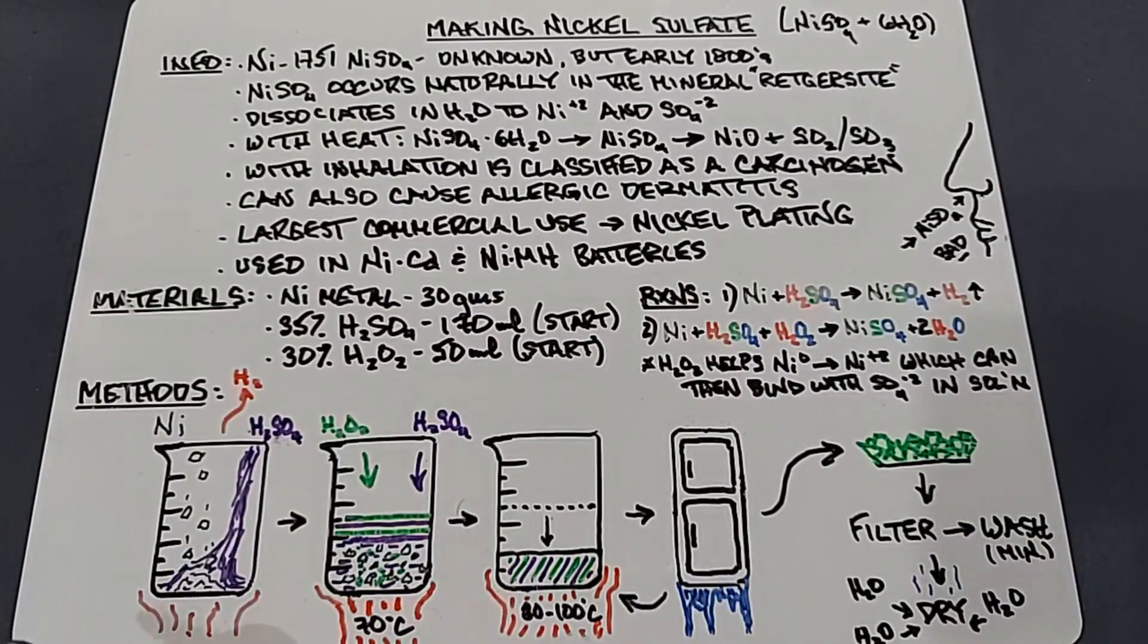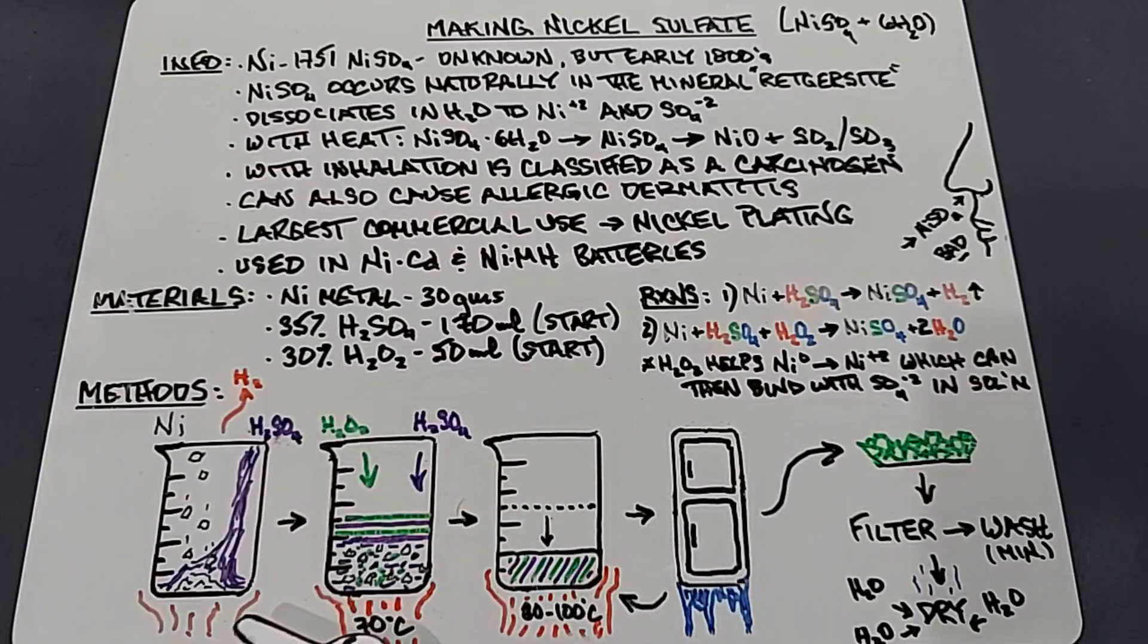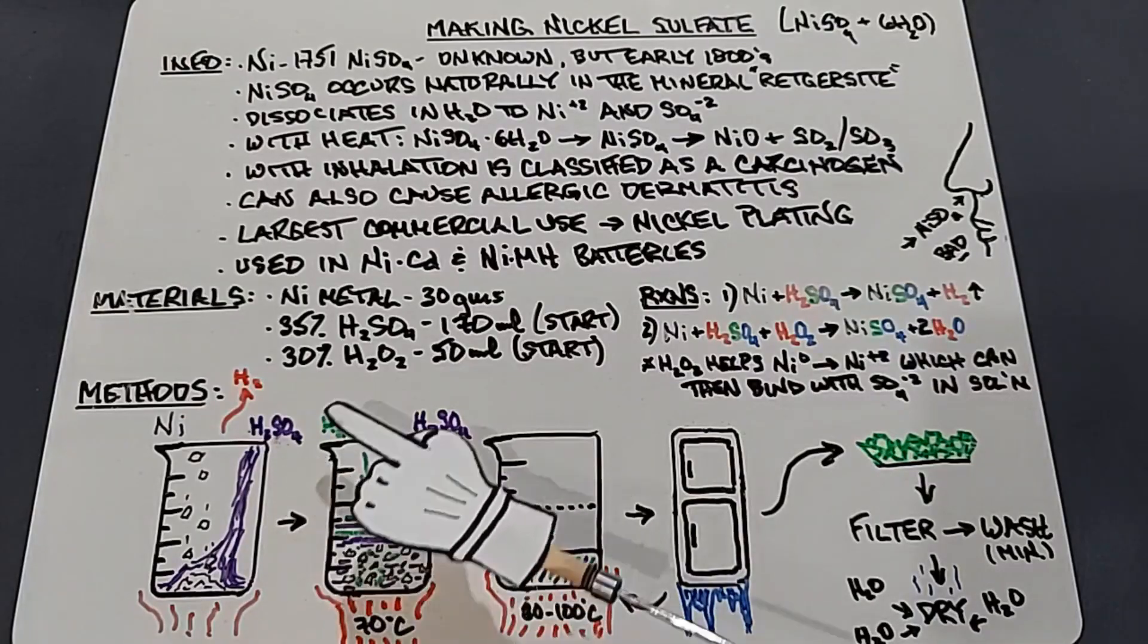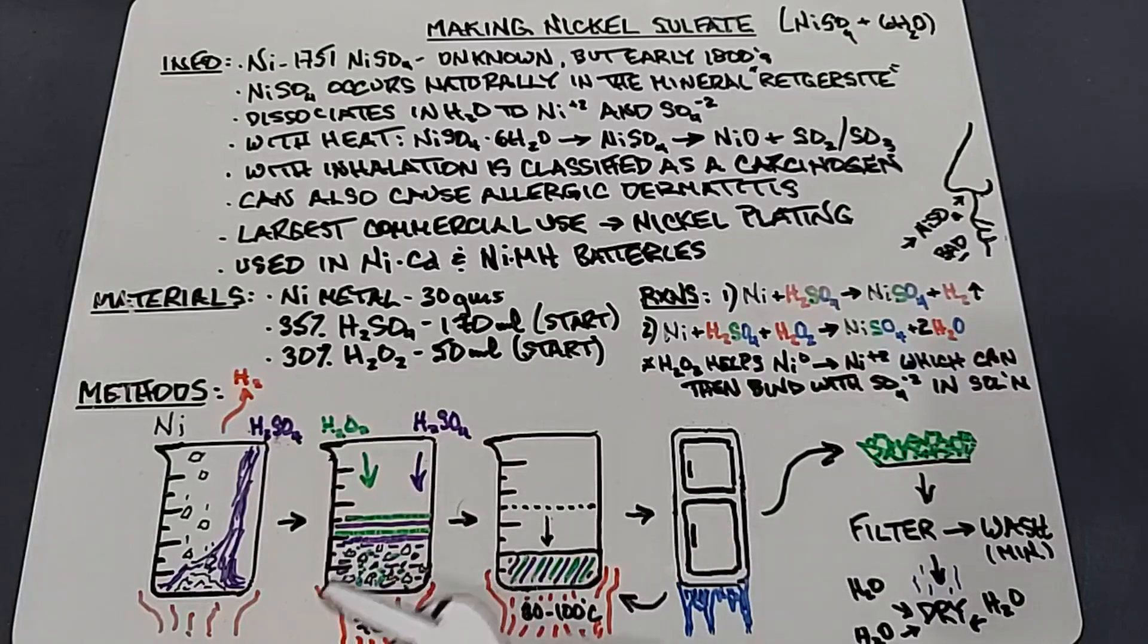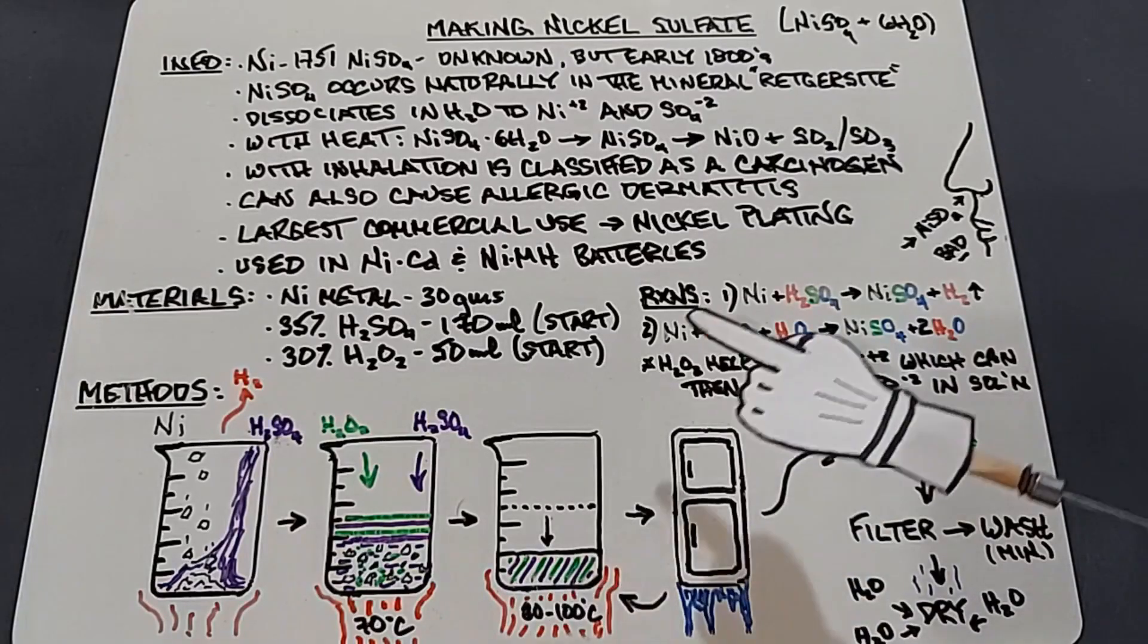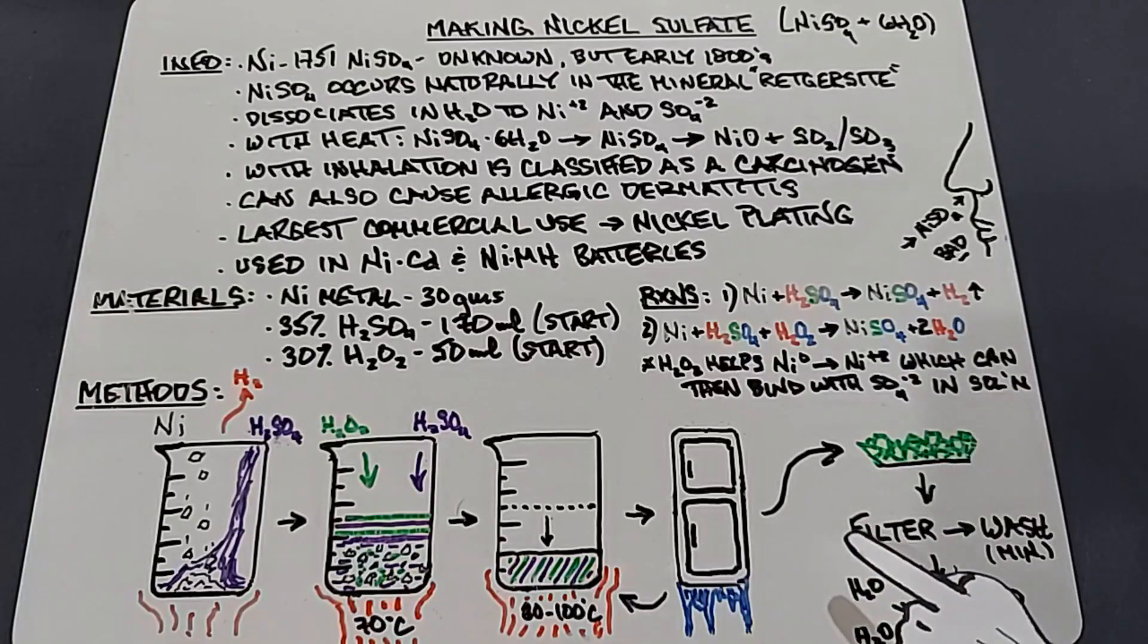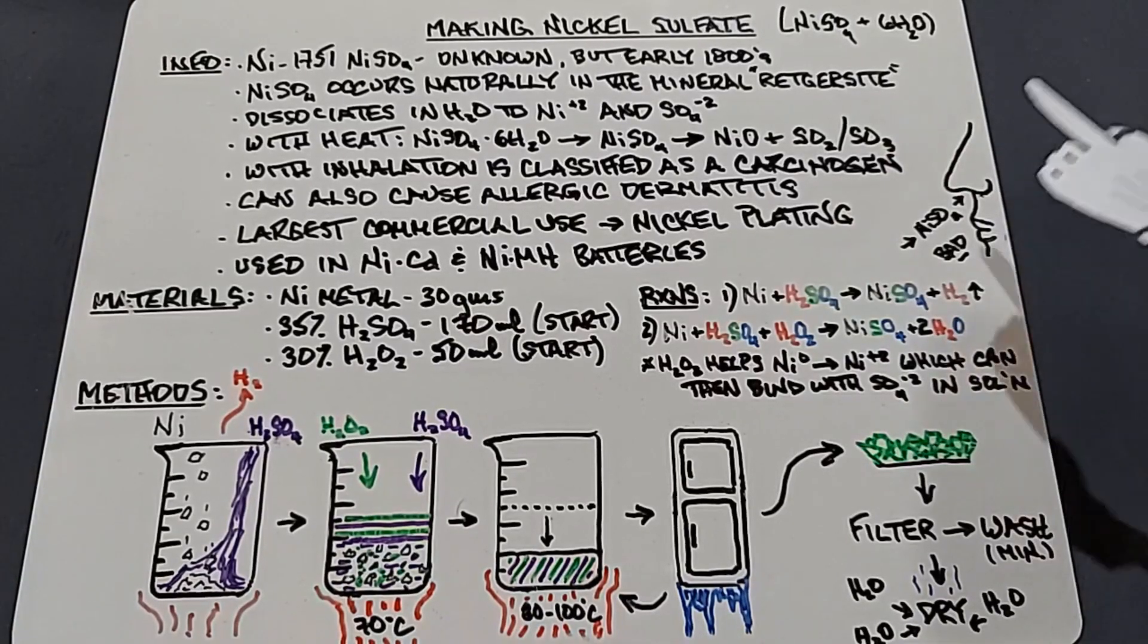In our methods, very similar to the nickel chloride: nickel metal in a beaker, adding sulfuric acid - 35%, be aware of the hydrogen that's going to be released. With heat, add more sulfuric acid and hydrogen peroxide, sometimes alternating. Keep it under 70-75 degrees Celsius because of the hydrogen peroxide. Once everything is dissolved, it's simply getting rid of the water. Be careful not to overheat it above 100°C - nickel sulfate much like nickel chloride starts to break down. Put your solution in your fridge or freezer, wait for it to crystallize, then filter, wash with vacuum filtration, and dry. Nickel sulfate hexahydrate is hygroscopic but you don't have to be quite as careful as with nickel chloride. Let's go make our nickel sulfate.